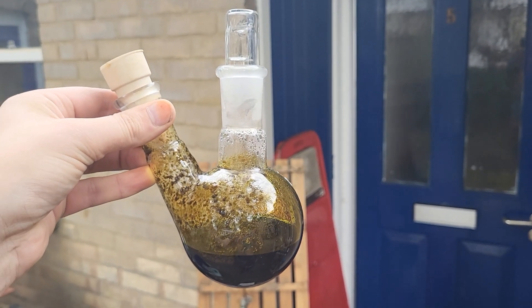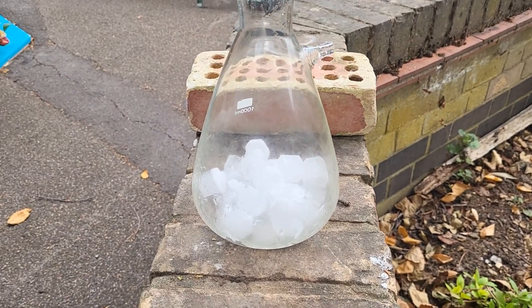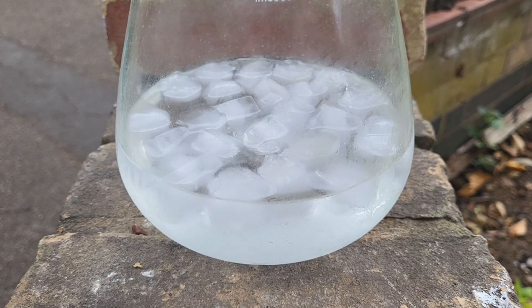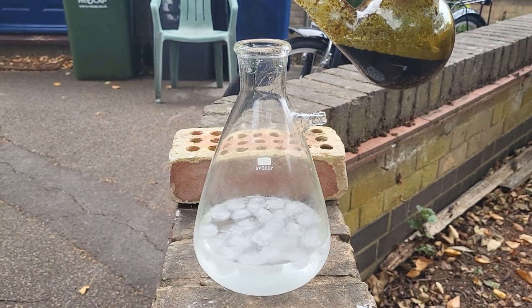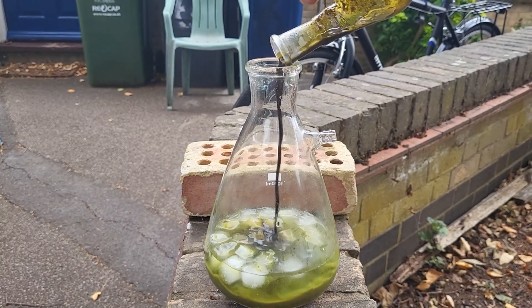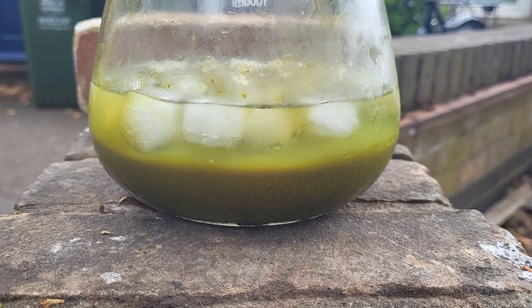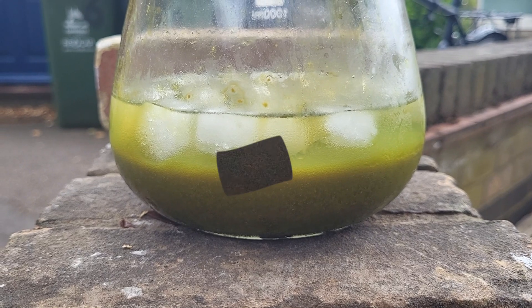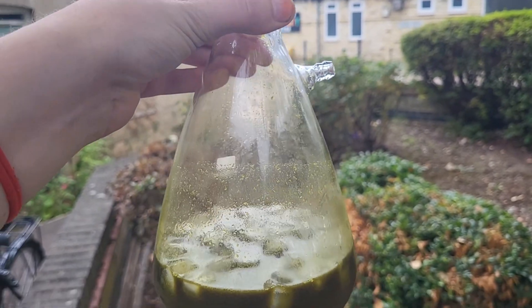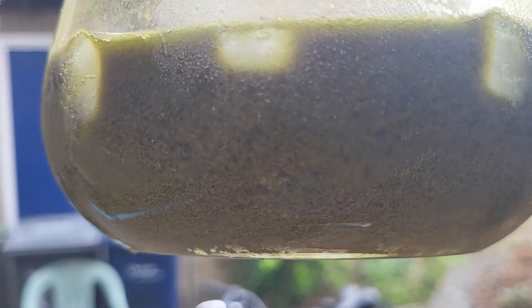Once this cools down I'm going to pour it in some ice water. There you go, some ice. Anthraquinone should be in there. You can see particulate matter in there.